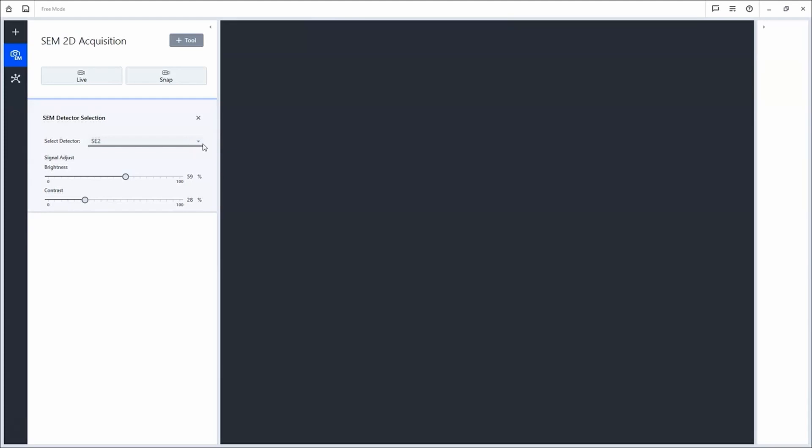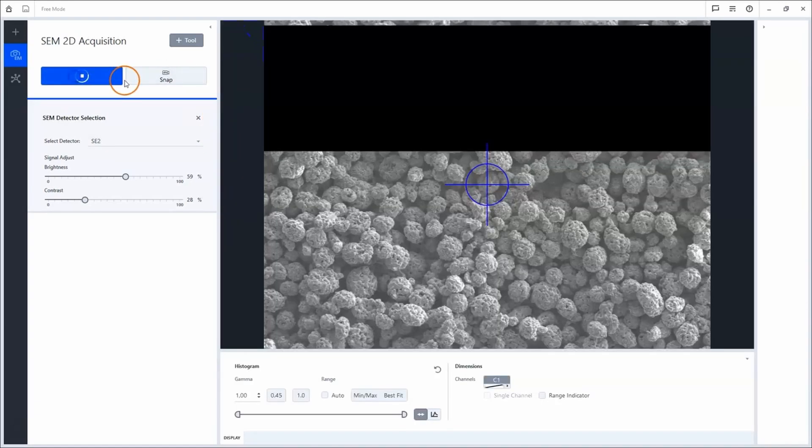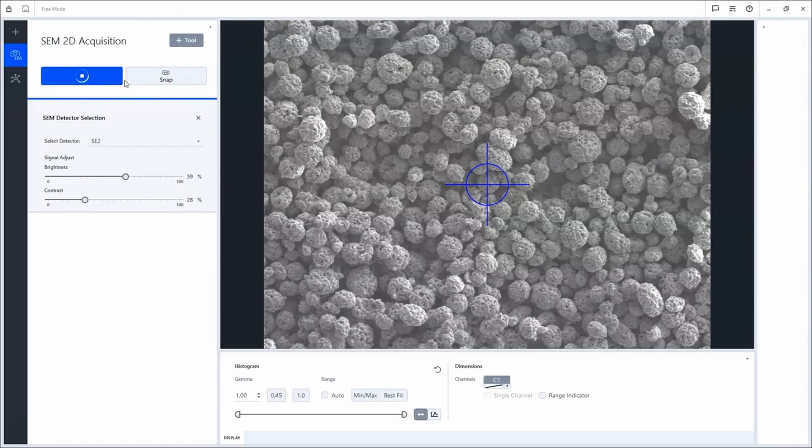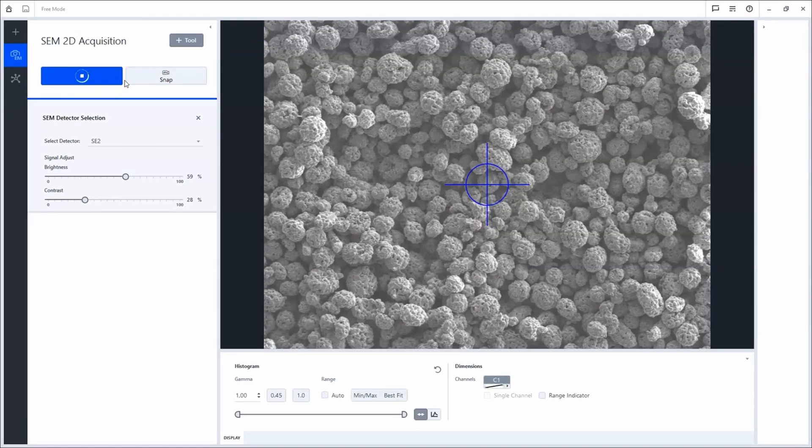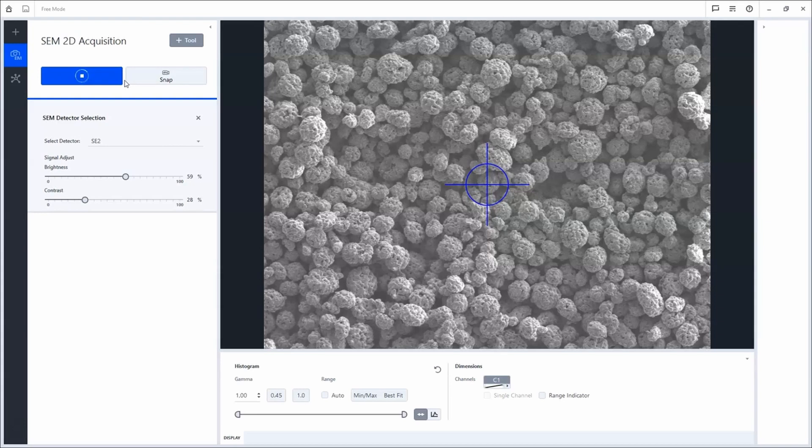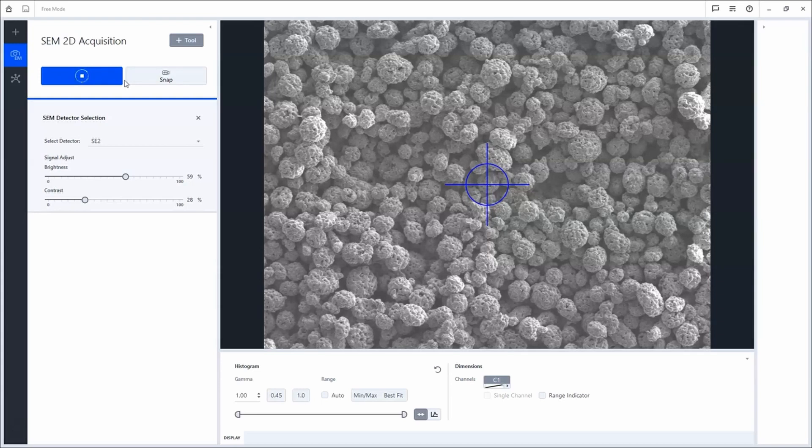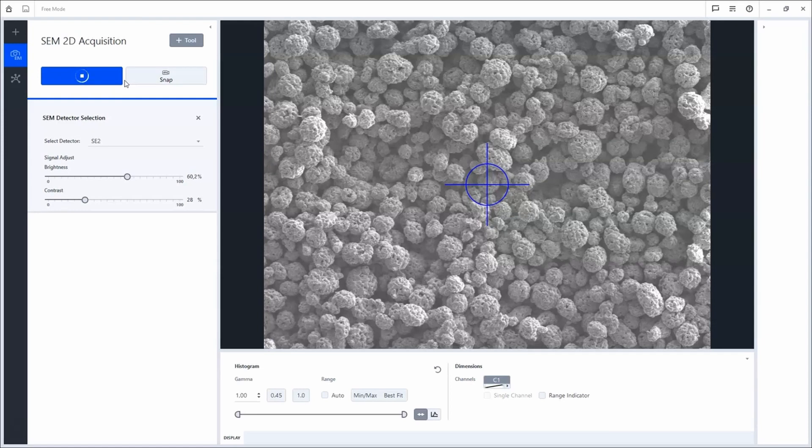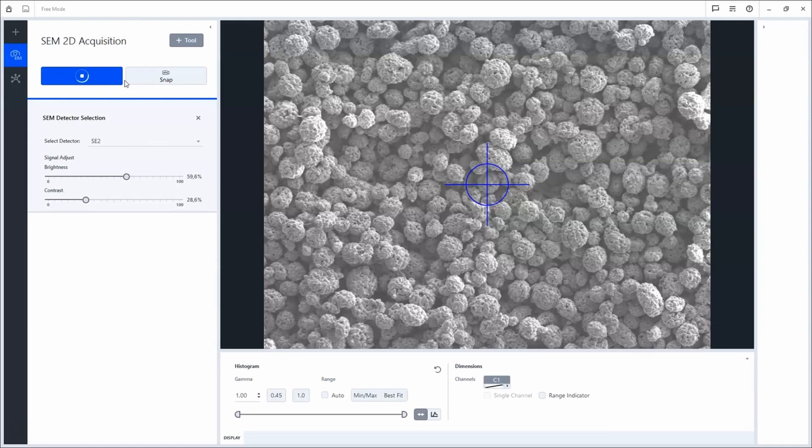First, I will start to acquire an overview of a larger area of a powder sample. To do so, I click Live and use the SEM Hardware Control Panel to set up my imaging conditions. You can adapt for example Brightness and Contrast or Scan Speed.